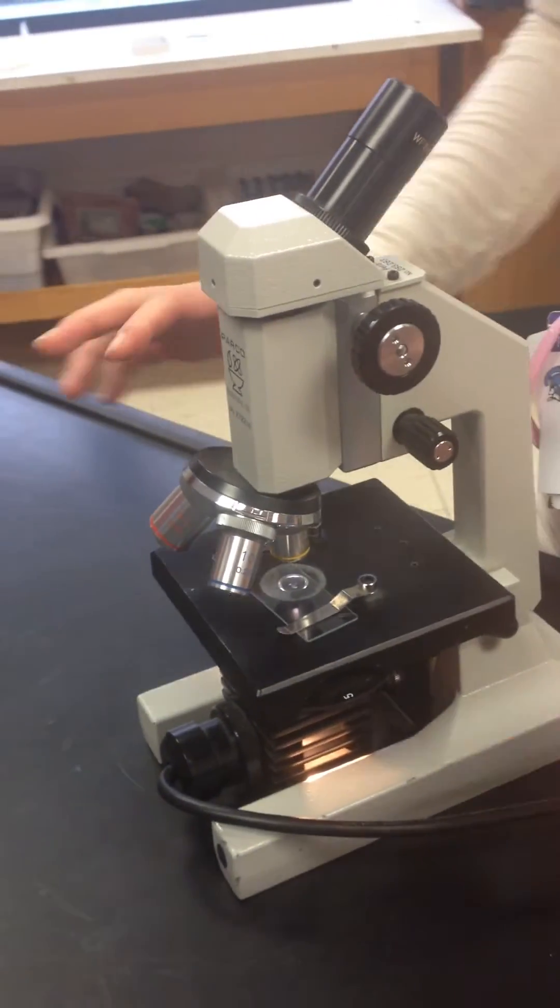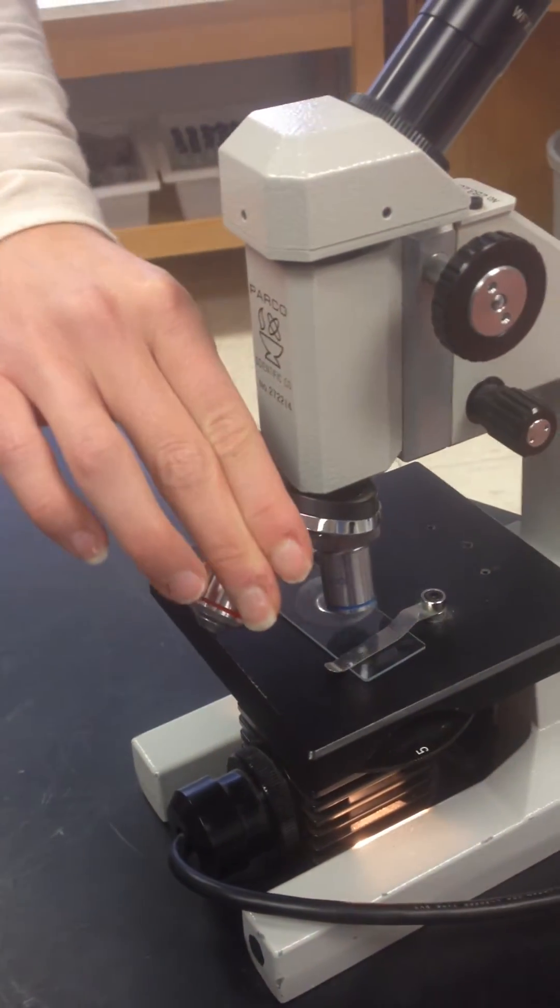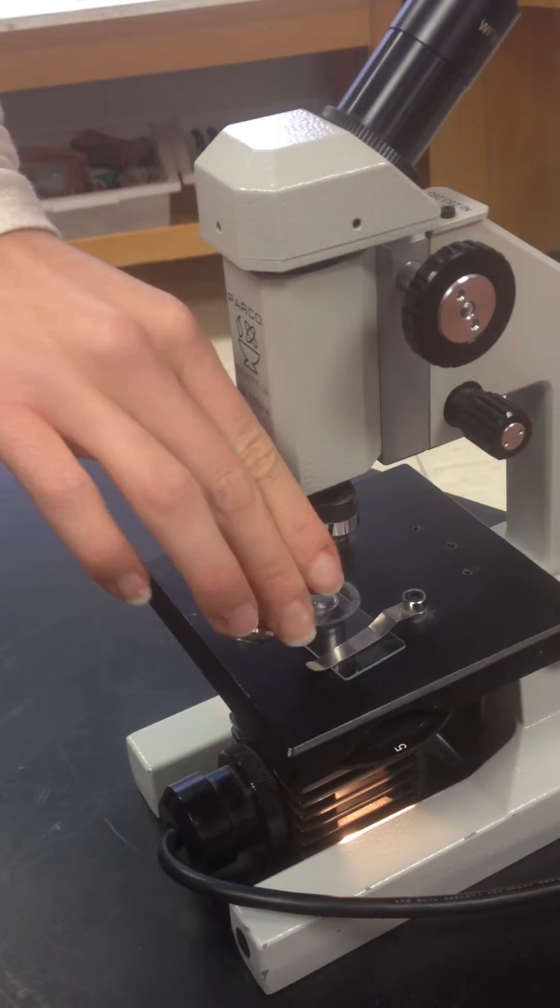Once it's perfect, you then are going to grab the revolving nose piece and rotate around until it clicks to low power.